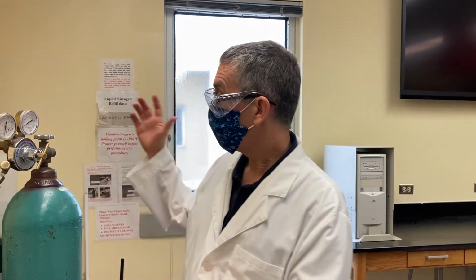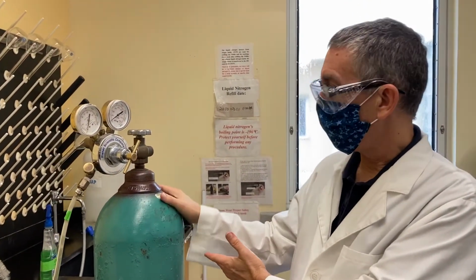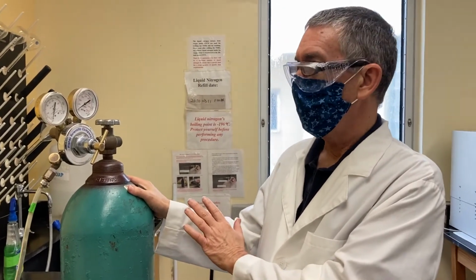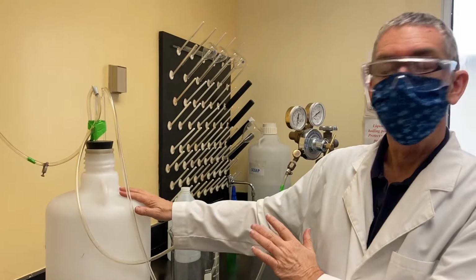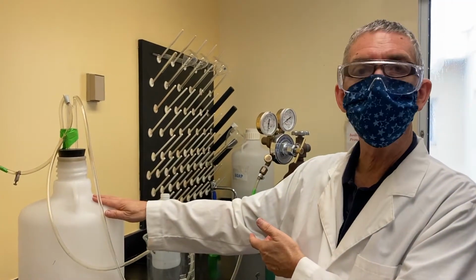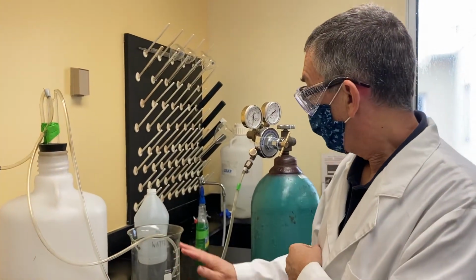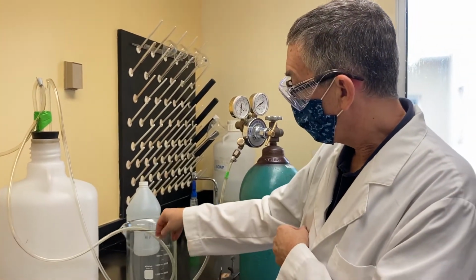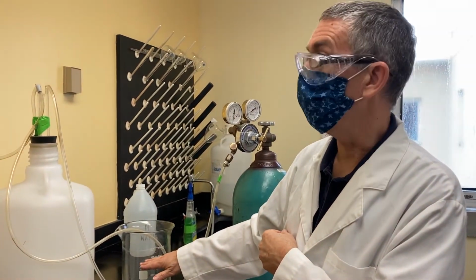So here you see we have a gas tank. This gas tank happens to be filled with argon. Then right here we have a carboy, which is a big plastic bottle. The gas is going to go into this carboy. That's really the center point of your experiment. We also have a beaker here that we will partly fill with water so that we can measure gas flow.